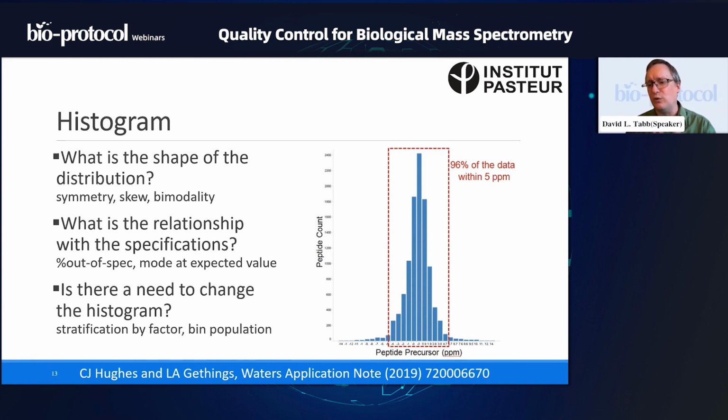There are many times when we'll find that, well, just to make it topical, to say, for example, that a TOF might tend in the upward direction of mass error rather than down. So in this case, its mass errors would more likely rise than fall, and so you wouldn't see a symmetric Gaussian distribution, but rather something that pushes over to the side. So the symmetry can help you see that. The skew, which is to say, is it centered or is it pushing left or pushing right? Or the bimodality. Bimodality is a very big deal.